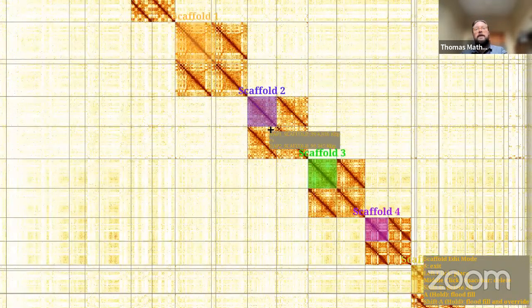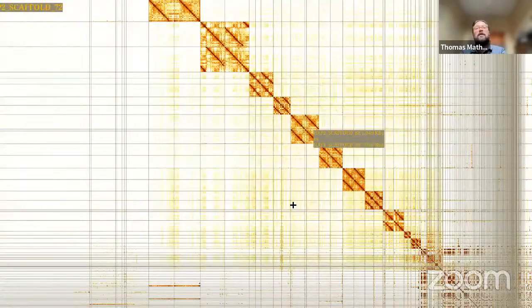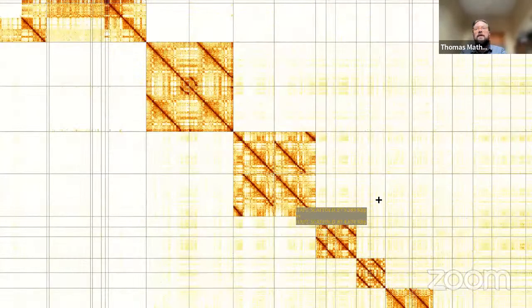And what we want to do eventually, when we've counted them all up, is have what looks like the correct scenarios here. So this is another one which looks like it needs a flip.